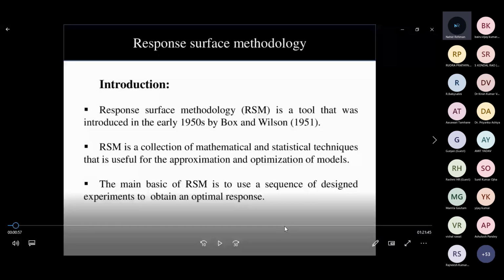After that, you have to optimize the next parameter, and let us say that parameter is the pH. So what will you do? You will keep the first parameter, temperature, constant, and then you will vary the pH of your media.